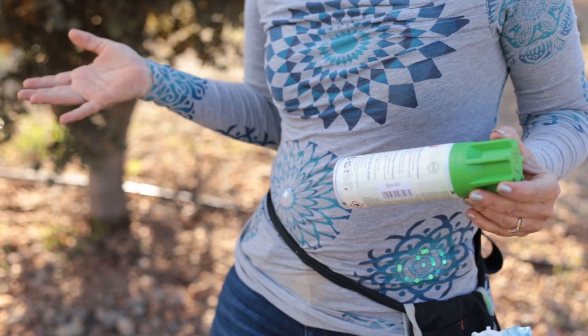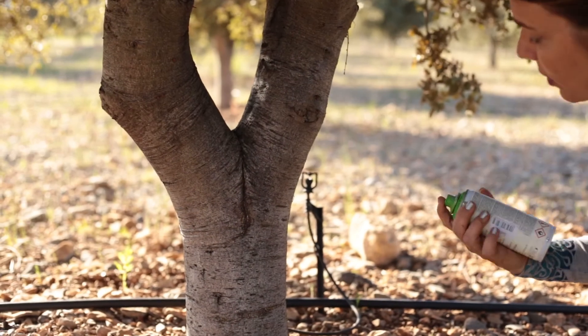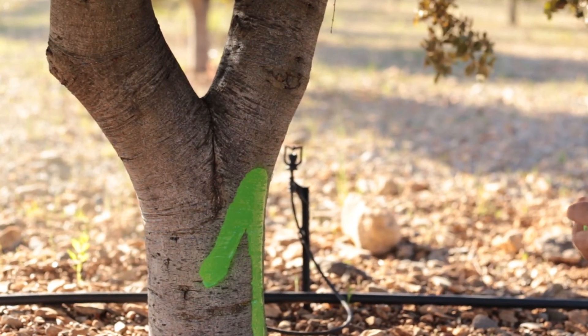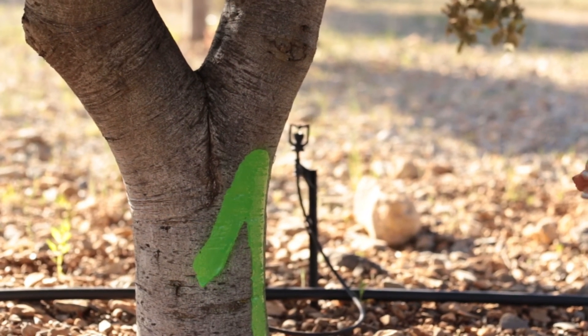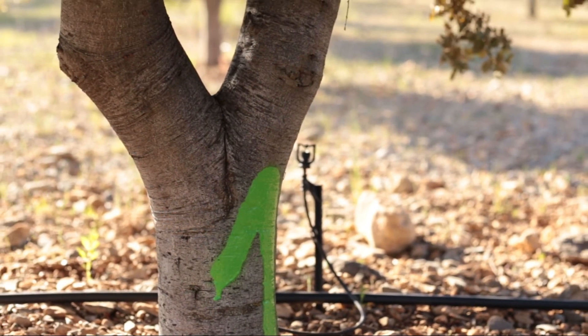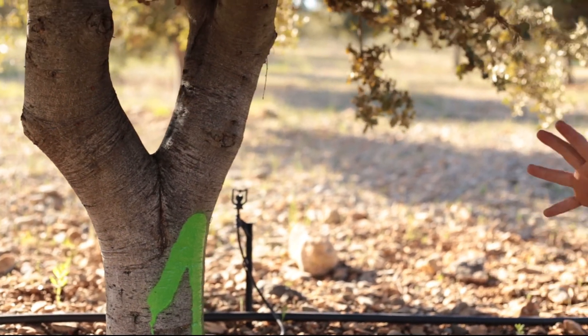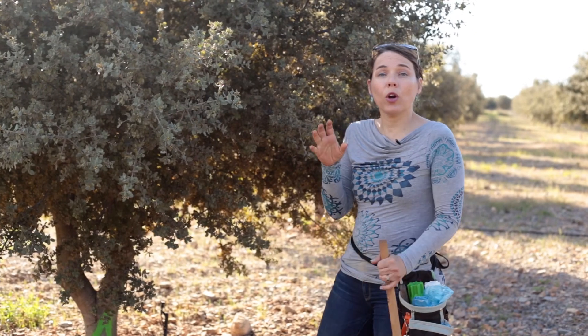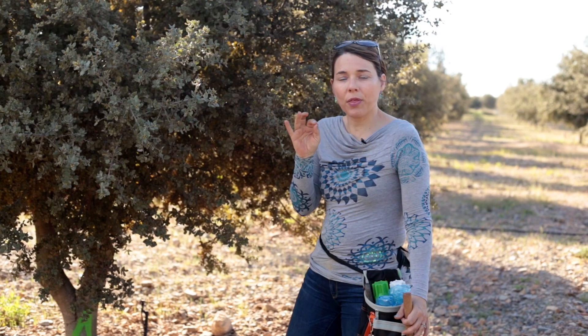We don't put the client's initials on the tree since they already know it's their plantation — we just need to mark the tree number. So this is tree number one, we're just going to mark it with a number one. Remember to use a spray that is weather-resistant and for outdoor use. That's important because we need it to last at least two years, since we normally do monitoring every two years.